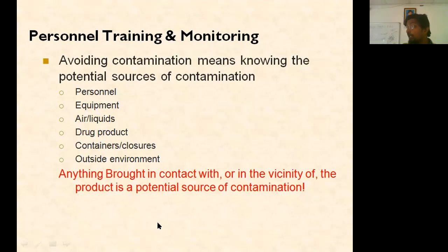So you should cut the connection from the outside environment. You should allow the air to be screened air, quality air, right? With proper humidity, proper air quality, proper speed, and free from all dust, bacteria, and everything should enter into the room. And especially environmental monitoring.